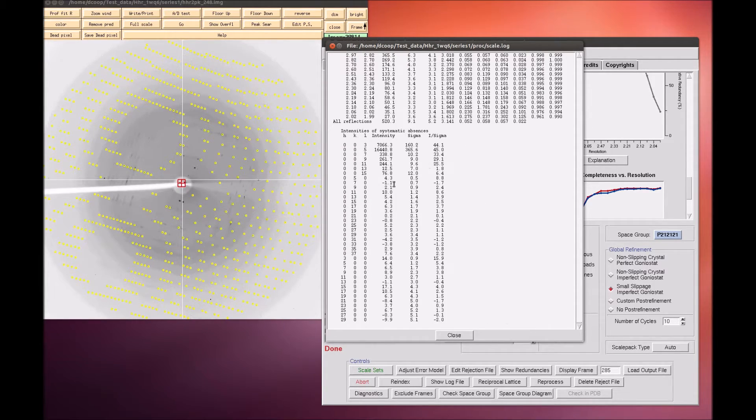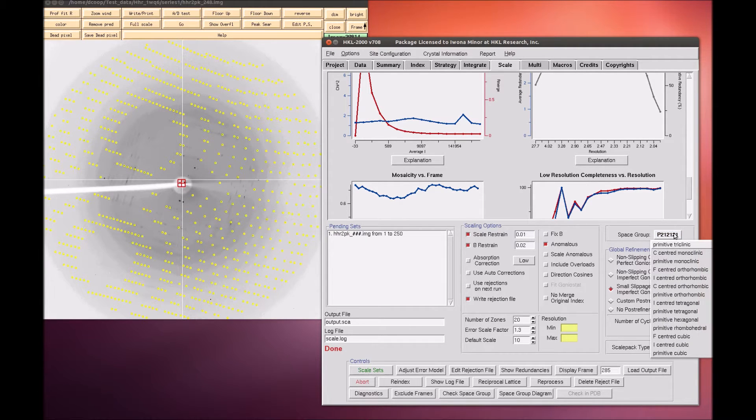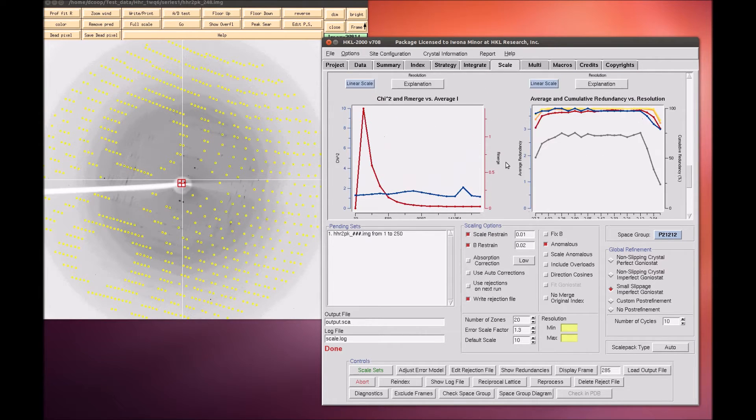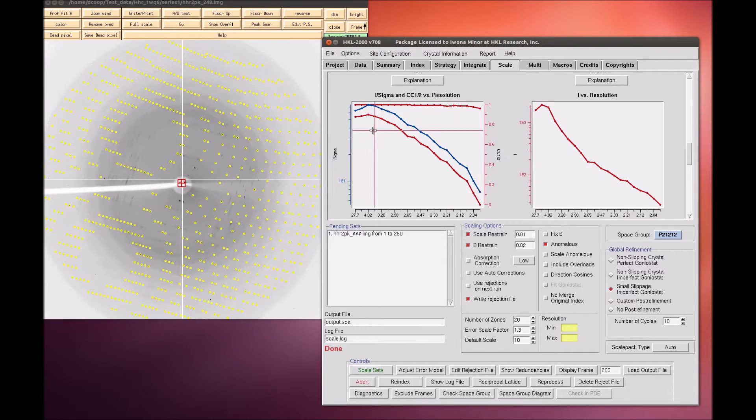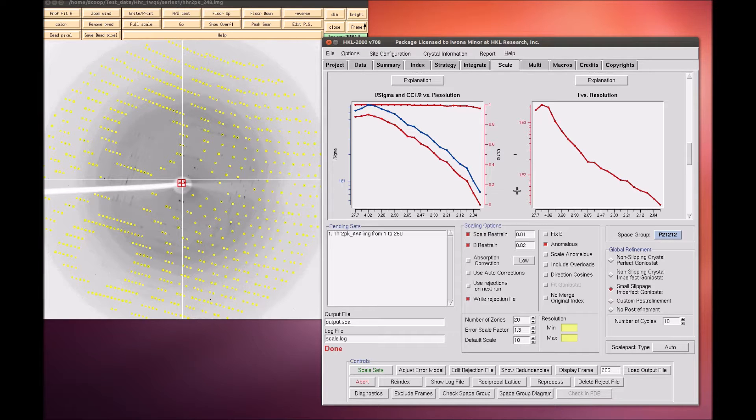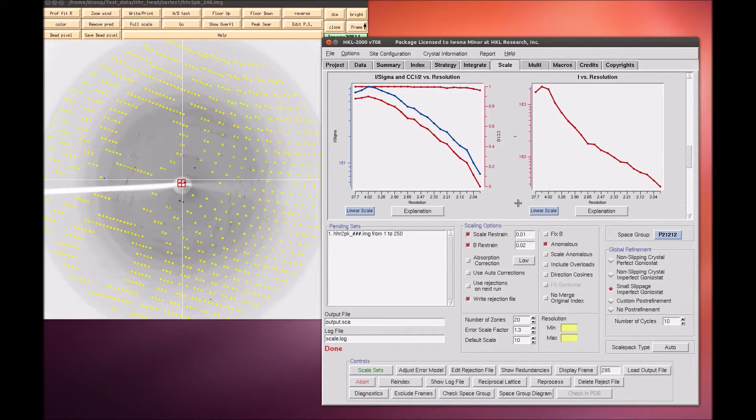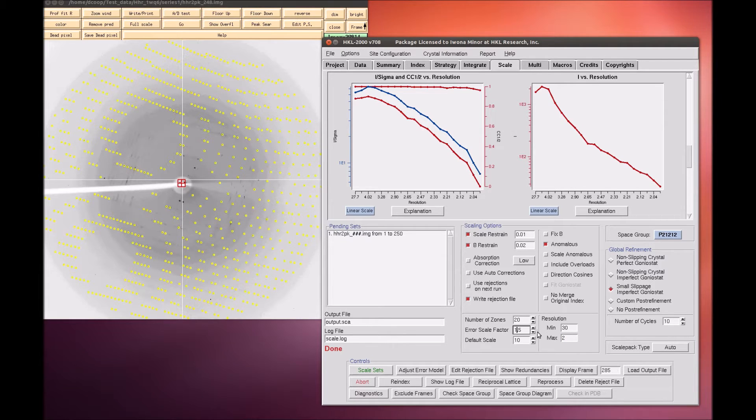Scaling the data is an iterative process. The first pass can be used to determine the resolution limits and the overall scale factor. To set the resolution limit, look at the graph of I over sigma versus resolution. This graph also has a graph of the CC one-half, which is another parameter that some people use for setting the resolution limit. If your data is weaker than two sigma, a line will appear on the graph suggesting a resolution to truncate your data. This is strong data, so we will use all of it. Set the upper and lower limits of the data based on the strength of the diffraction and the size of the beam stop. The error scale factor can be increased if too many reflections are being rejected, but that is not a problem in this example.